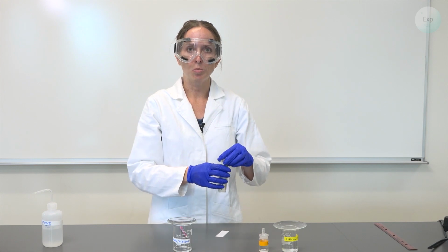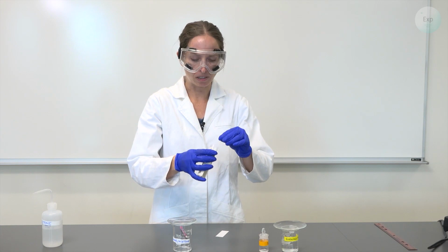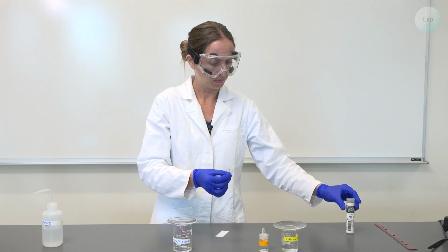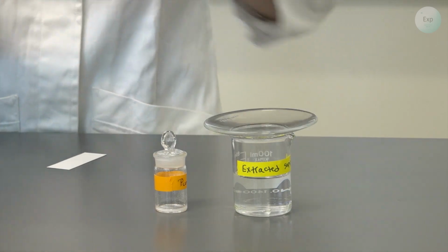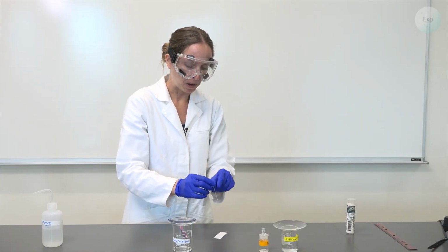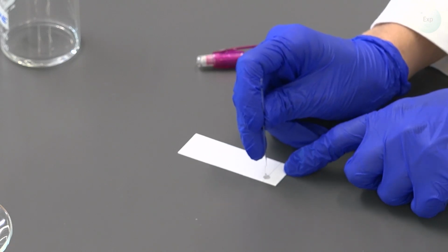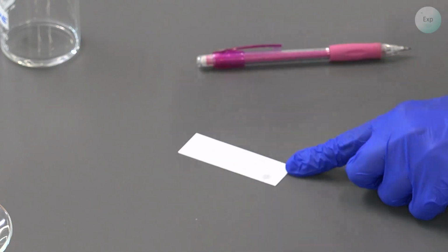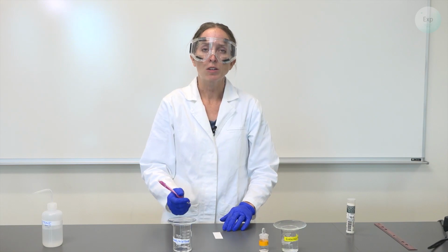I'm going to use the capillary tube to take a small amount of my sample and spot it onto the TLC plate. I will simply dip the capillary tube into my extracted sample. And I'm going to spot it on the TLC plate. I'm touching the capillary tube to the same spot several times. Next, I'm going to label where that spot had been with a letter E for our extraction.